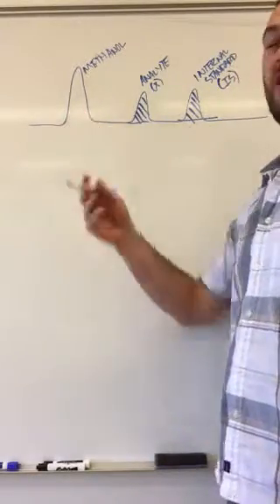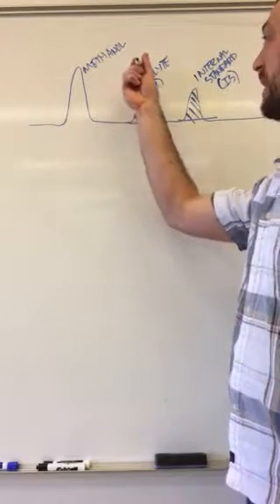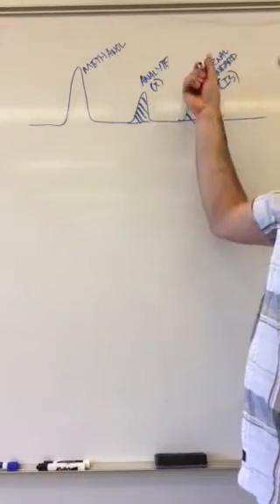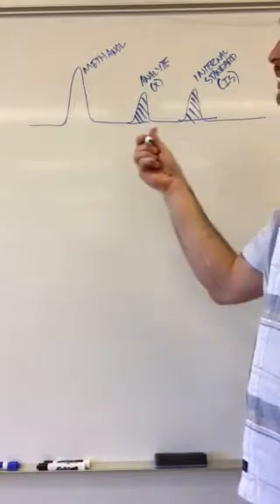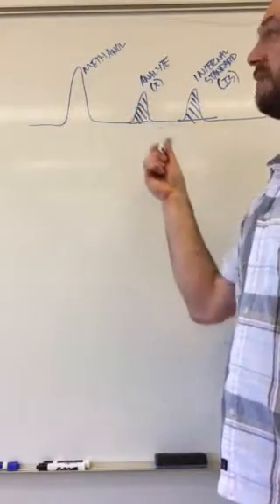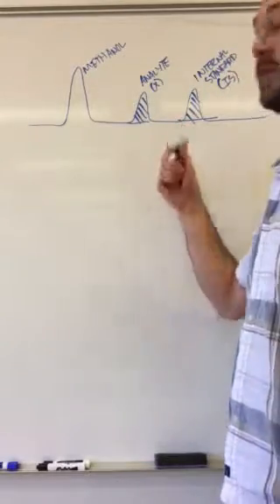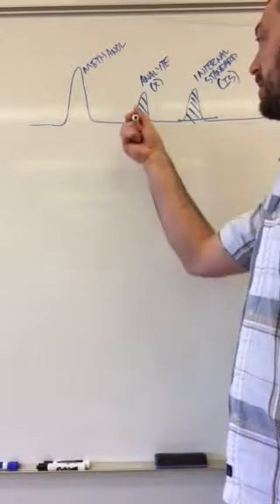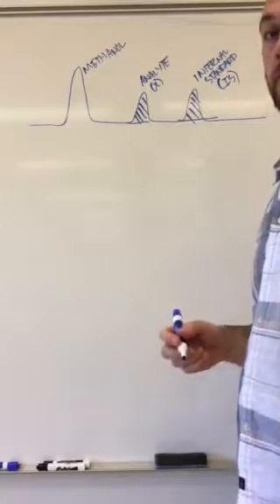So you have a methanol peak, which we really don't need to worry about for this experiment. And then you have an analyte peak, which I'm going to abbreviate by X, and an internal standard peak, which I'm going to abbreviate by internal standard, or IS. And you would only get a chromatogram that looked like this, where this was your analyte, if the analyte had a lower retention time, was earlier eluting than the internal standard. And remember that we're going to be looking at peak areas to measure the response, so that's the area under the curve, the shaded area, right?